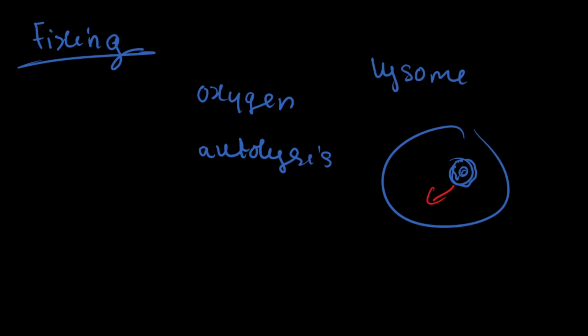Okay, apart from this autolysis, other forms of postmortem degradation could take place. Okay, so this tissue block could start to decay, it could start to undergo putrefaction, which of course is another fancy word for decay. Now, what fixing does is that fixing helps to retard these processes of autolysis. It helps to kill the bacteria, and it helps to prevent postmortem degradation.